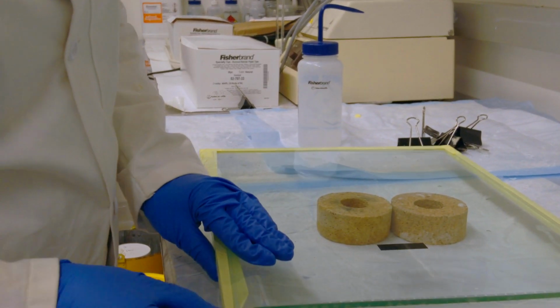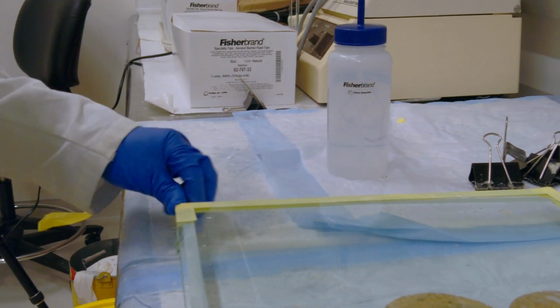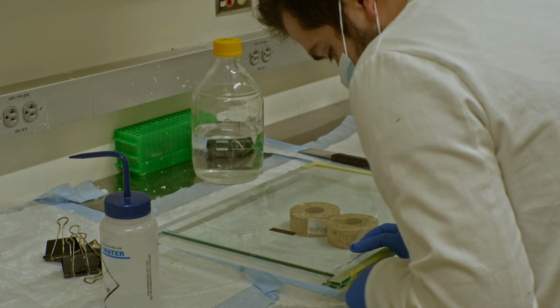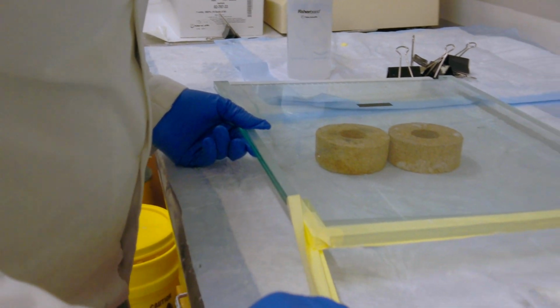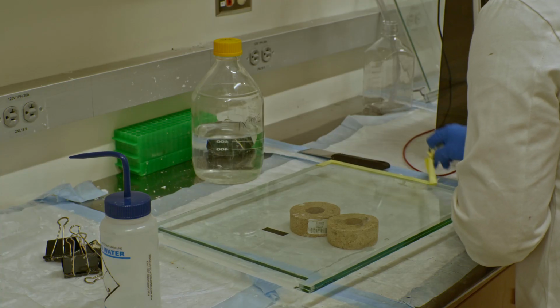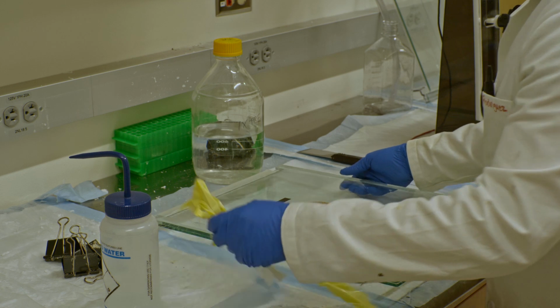Try to leave as little tape residue on the plates as possible. Sometimes it does interfere with how current runs, but if you see a little bit of tape, like that little speck right there, it should be okay. That's one piece of tape. Flip it over. Repeat again. Okay, and as you can see, this last piece of tape really stuck onto the bottom. So we're going to use it to help us take off the bottom piece of tape. And there you go. Now you have your gel out of the tape.